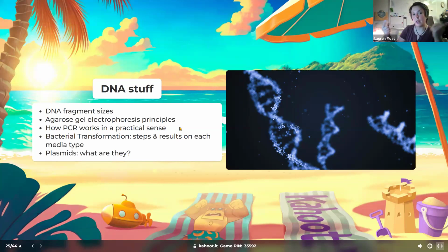And then elongation, adding on nucleotides that are complementary from that primer, building off of that. You cannot add nucleotides without building off of the primer. DNA polymerase requires that a primer be there. So if the primer doesn't bind, the nucleotides can't add on, and therefore you would be negative for whatever you're doing the PCR test for. Only if you're positive for it will the primers bind, and then the nucleotides build off of the primers.